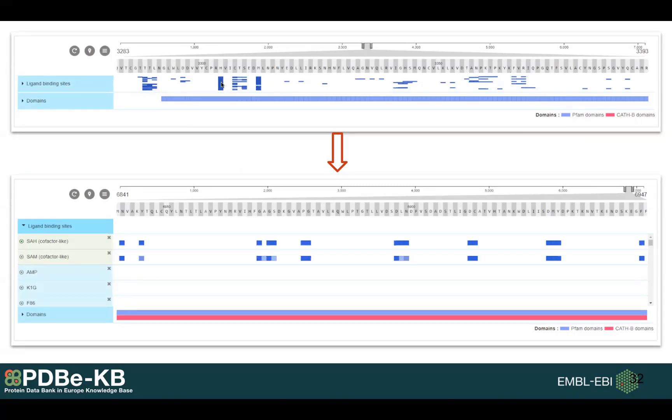You can see which are the residues in the protein that are consistently interacting with different small molecules. If you expand it, you see that for this particular small molecule these are the residues which are involved in interaction. But if you collapse it, you can see that actually these two residues are always interacting, except for this particular instance.